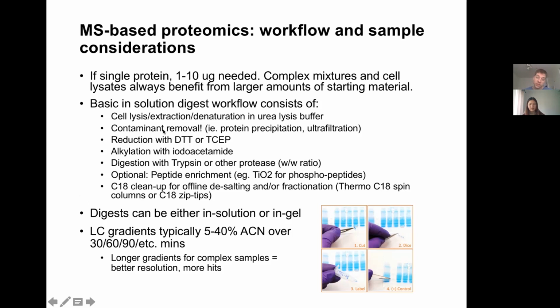Digest can be either in solution, as I said above, or in gel, which I'll talk to you briefly about. And then here now, the LC gradients are going to be longer than the intact protein gradients, because we really want to separate these peptides by time so that the mass spec has a chance to identify and quantify them accurately. And so here we're just going to 40% acetonitrile because we're now working with these peptide fragments, which will elute earlier. And of course, you can do 60-minute gradients, 90-minute gradients, up to 3-hour gradients.